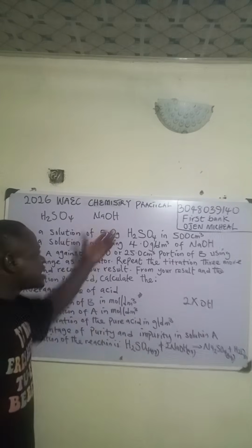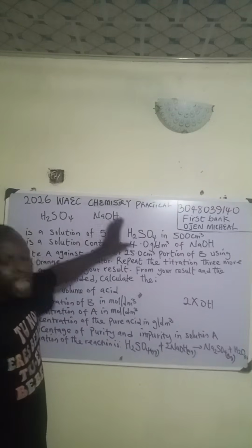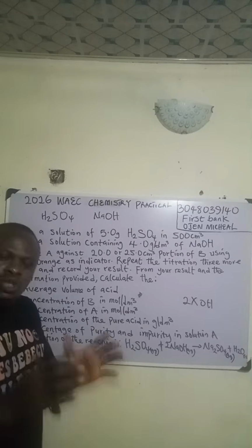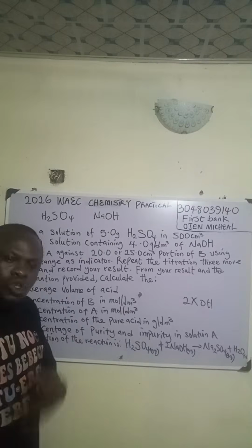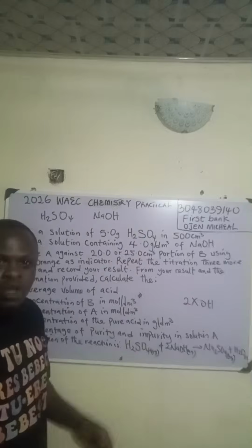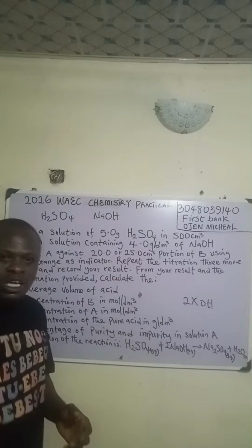I will prepare this. The titration is expected to be done before the day of the exam, so that the students will have their endpoint. All right, so that during that day they will just do formality, because the exam is just 2 hours to write all 3 parts of the chemistry.